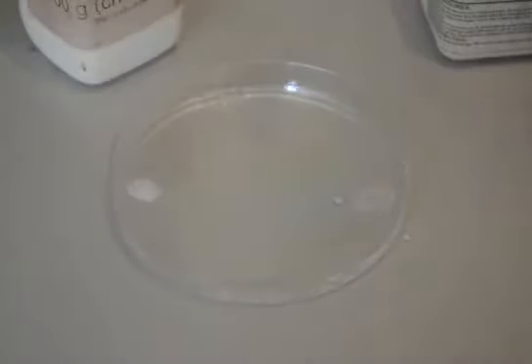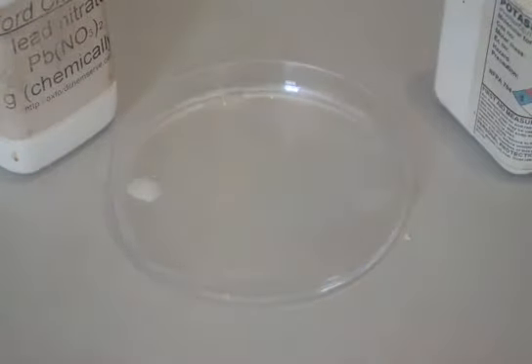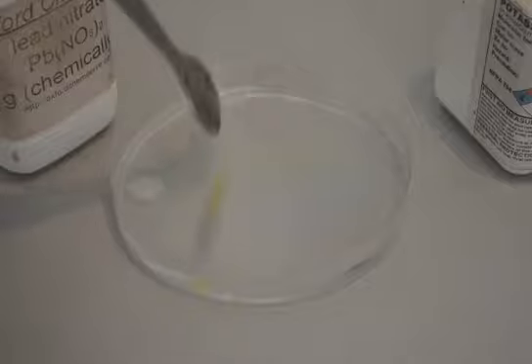So I'll put them in there and we'll just wait for them to react with each other. So we've got the lead nitrate on the left and the potassium iodide on the right. And at some point we should see there, we get the yellow line forming there.